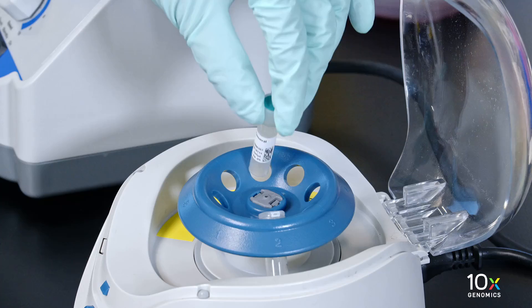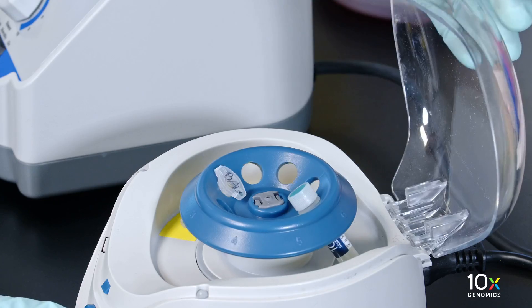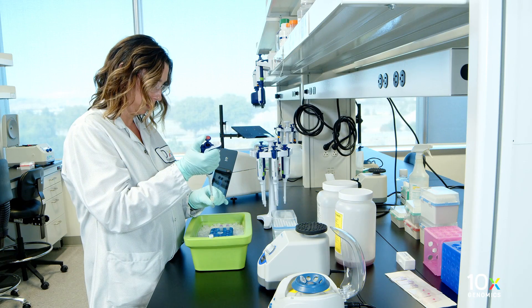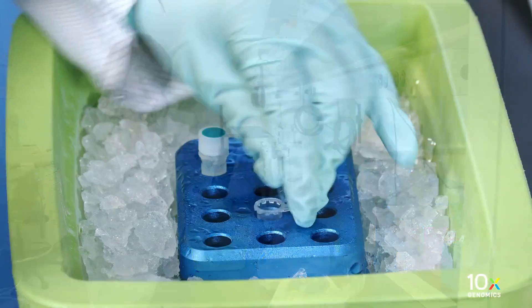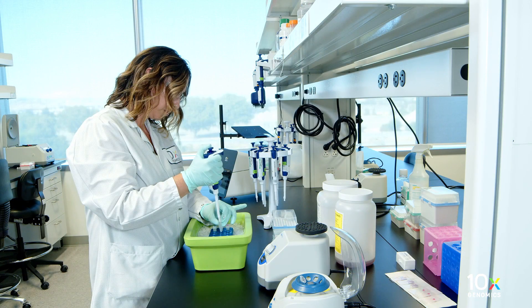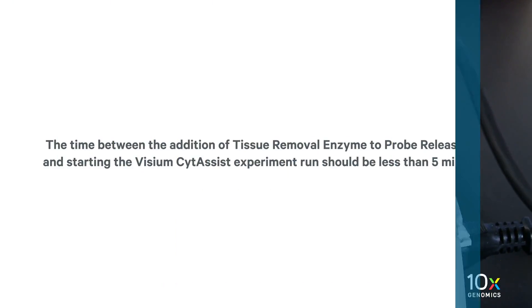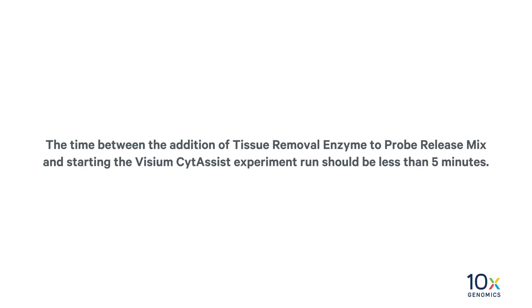Next, we will add the tissue removal enzyme to the probe release mix. Remove the probe release mix from ice. Pipette mix the tissue removal enzyme and centrifuge briefly. Add 4.7 microliters of tissue removal enzyme to 70.3 microliters of probe release mix. Pipette mix 15 times with a pipette set to 50 microliters. Centrifuge for 5 seconds. The time between the addition of tissue removal enzyme to probe release mix and starting the Visium slide assist experiment run should be less than 5 minutes.